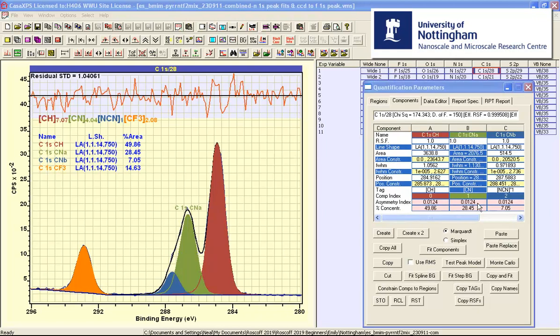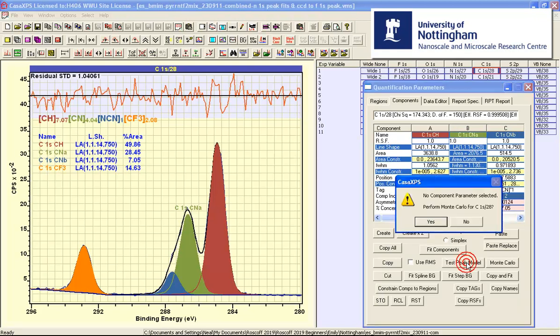To perform the Monte Carlo having selected the non-fitting parameter we press the test peak model button and then a dialog window asks whether we want to perform the Monte Carlo based on the data that are displayed in the active tile and the peak model that is displayed in the active tile. I will say yes.